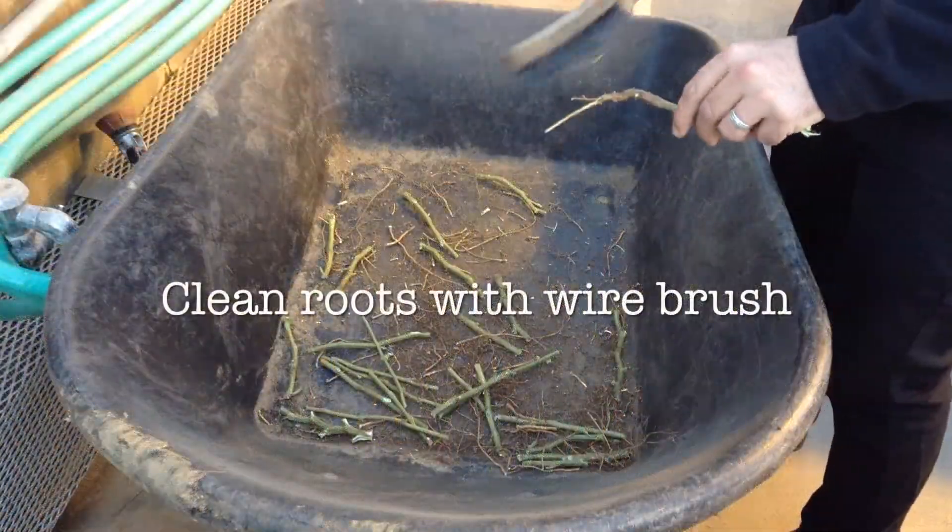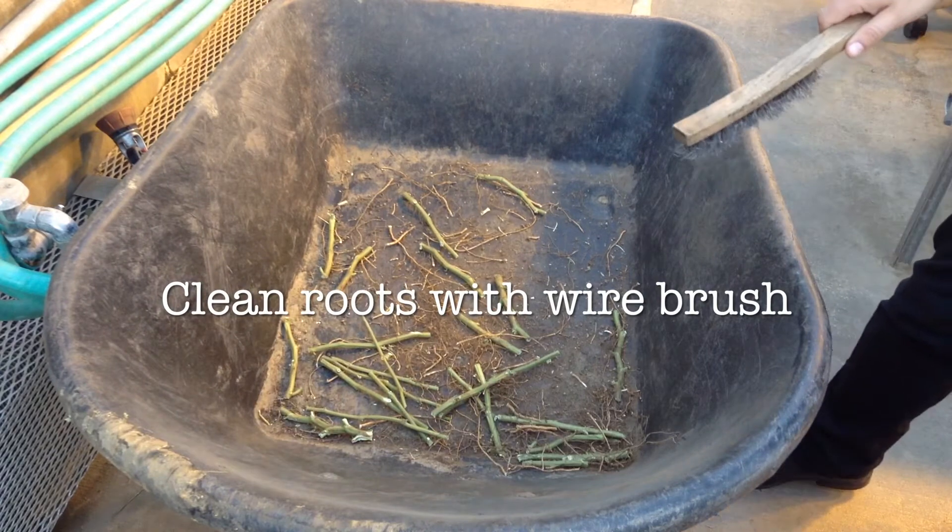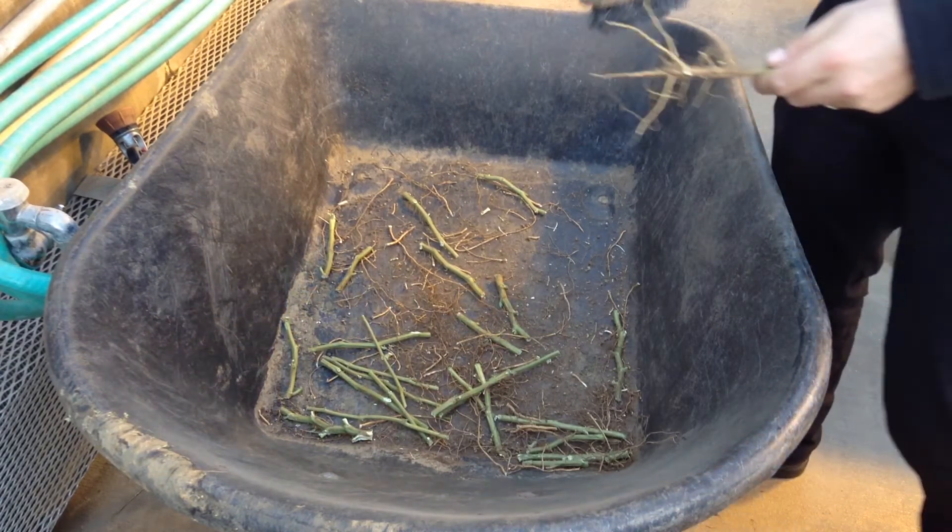After we've sampled the soybeans from the field we'll take those back to the greenhouse and clean them with a wire brush to remove all of the roots.